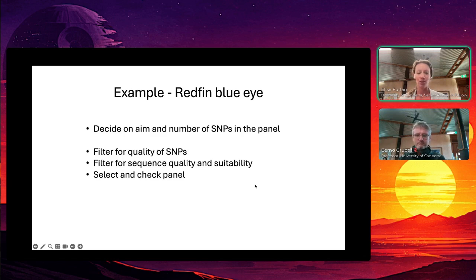Then, as Bernd said, in terms of the cross-checking, obviously you'd take them through the data that you've generated and show how your SNP panel is likely to compare with that GL check panel function, showing how it compares for some of the metrics that they might be interested in. That would be important. But the extent to which they can cross-check it, I'm not entirely sure.